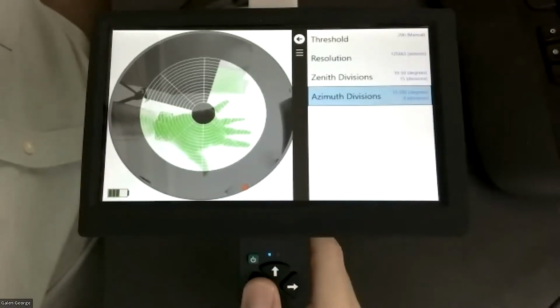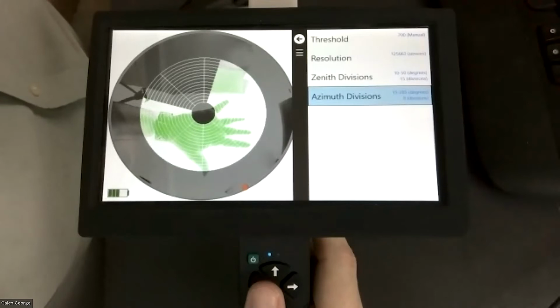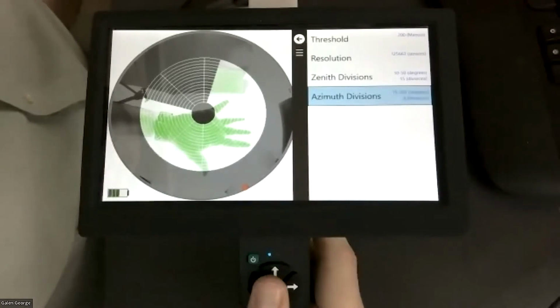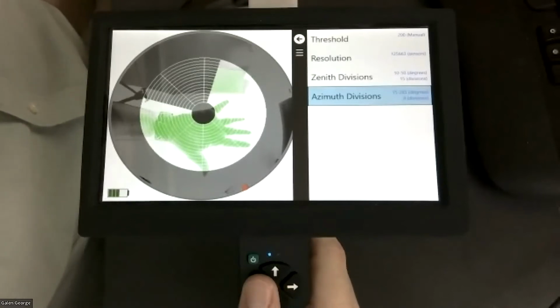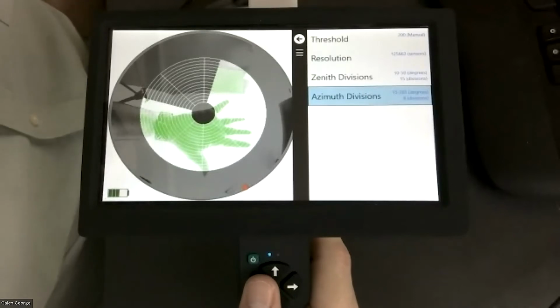So that's how you would filter out any sort of empty space. If you have big sections of empty space, or a tree trunk, or if you have yourself or another person in the image for some reason, or equipment or anything like that. If you need to get that out of the image because it's identifying as plant when it shouldn't be, then you can use this tool as well.